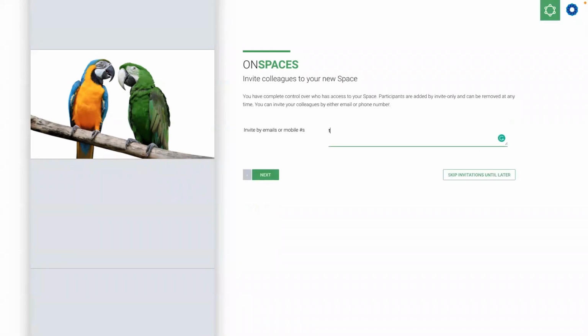I can enter the names and details. I could also do a cell number, by the way, so that you get a text invitation. So I'm going to do Trent at Rosalind.bio and Abel at Rosalind.bio. You can enter in any emails.